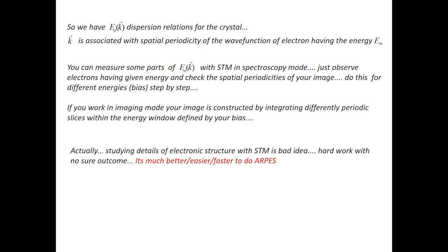Yeah, and it's not good to study this with STM actually, because you don't always see the standing waves, and the STM technique is very difficult. Sometimes, you know, it's just many weeks in vain. So it's much better to do it with ARPES.